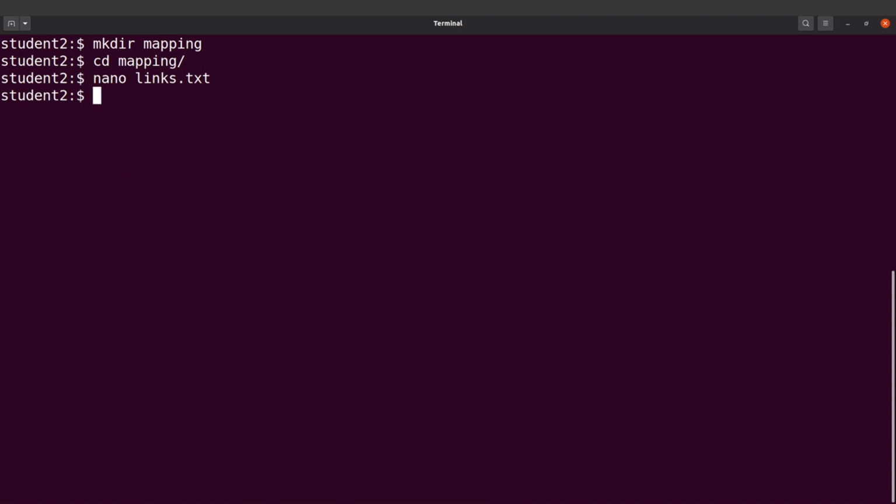So let's do this. Now we are going to automate this process. We can decide to create a script to do that, or we can decide to do everything on a timeline. It's up to you. It's basically the same thing. Okay, so I'm going to download the files and I'm going to use wget. You can also use curl or any downloader, but I prefer to use wget because I'm using a Linux system. So this is how we are going to do it.